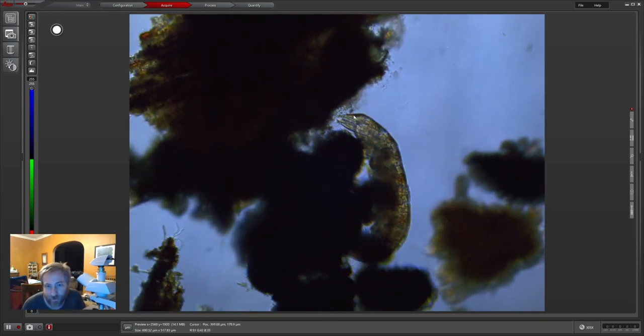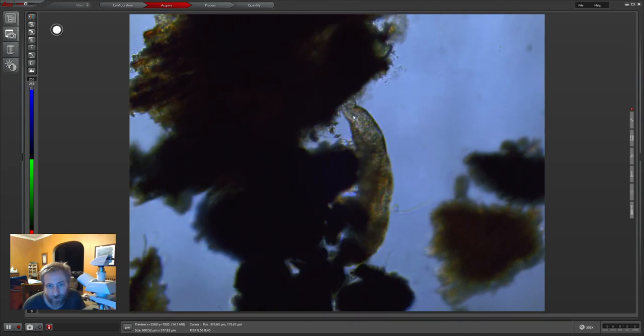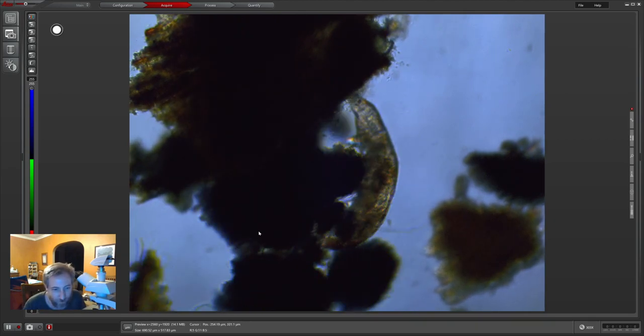You can see it's got a little star-shaped set of spines around the outside of its mouth, which is pretty cool.